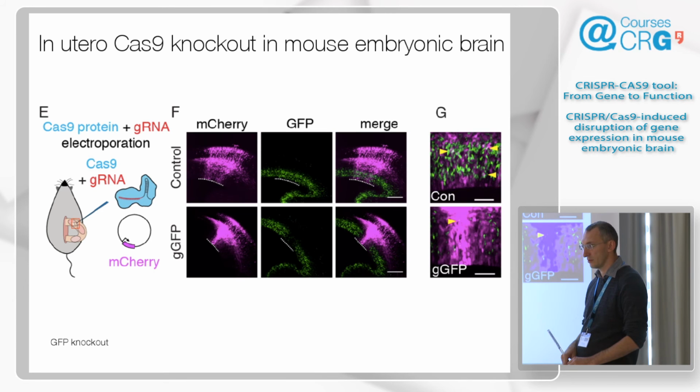Oh yeah, we could use an antibody to Cas9, and then we will not need the reporter. I see what you mean. Yes, we could do that. But we also have labeled Cas9 that works just as good. How many days do you wait till doing this calculation? This is 2 days later.